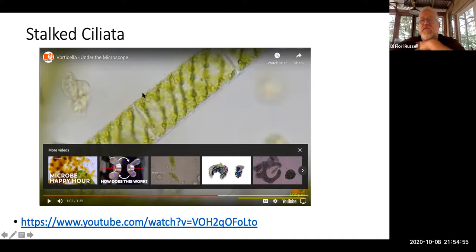One of the useful things when you're exploring the biodiversity of your sample is to scrape off the container walls, scrape on the bottom, pick up pieces of dirt at the bottom or leaf litter that might be in there, and look on the surface, because a lot of things attach to the surface of things that aren't just floating around in the water. So if you just took a drop of the water floating around, you may not actually find much, because a lot of this stuff is attached to something else, either attached to other algae or, like I said, leaf litter and that sort of thing. That's because these things often live in streams and whatnot where there are currents, and if they're not attached, they would simply wash away.